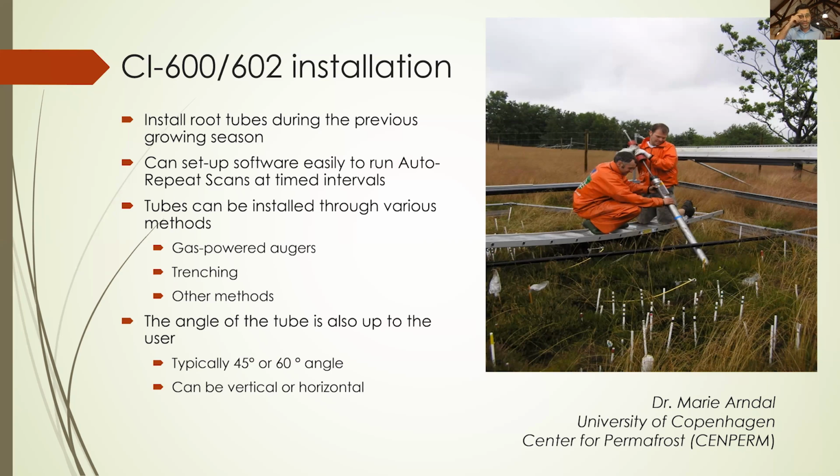So when we do sell these tubes individually, and when we give you the 6 with the instrument, we actually have installation caps and give you the ability to buy a gas-powered auger to install these.